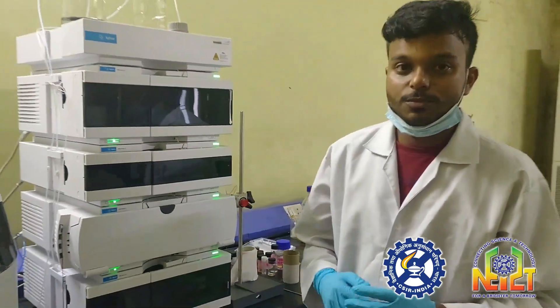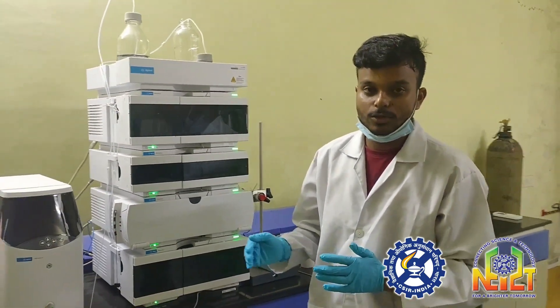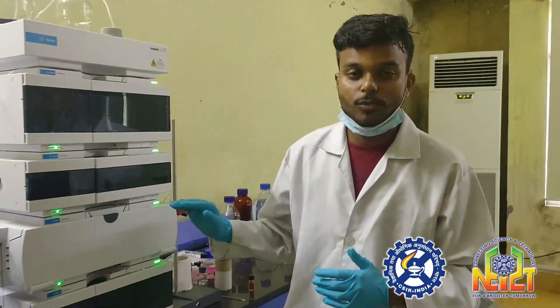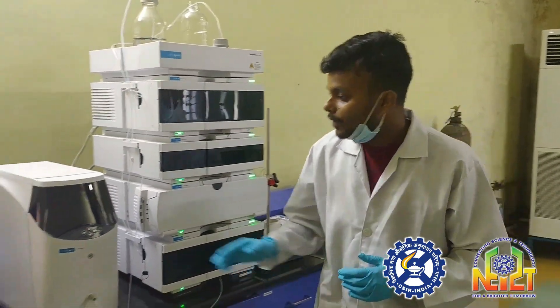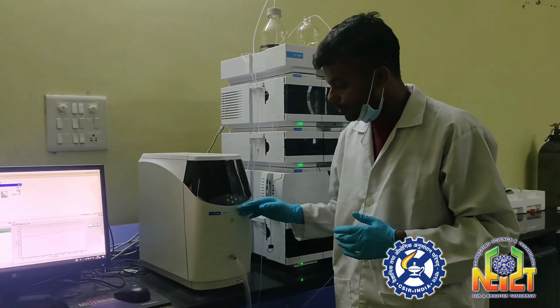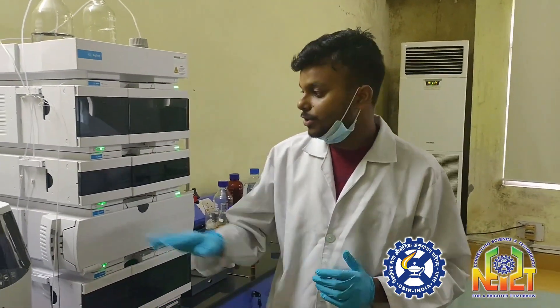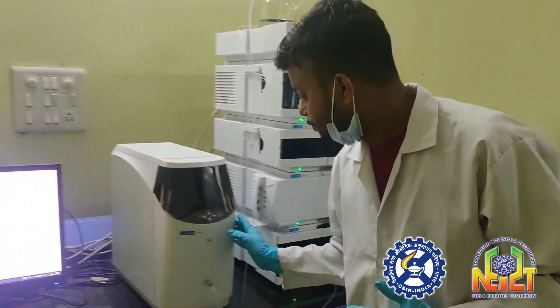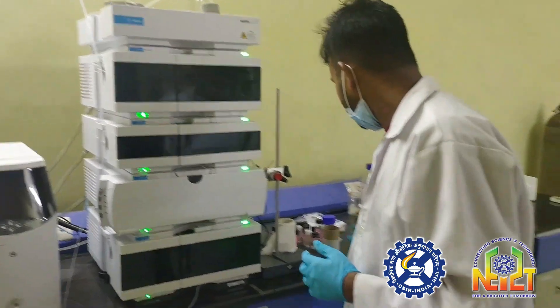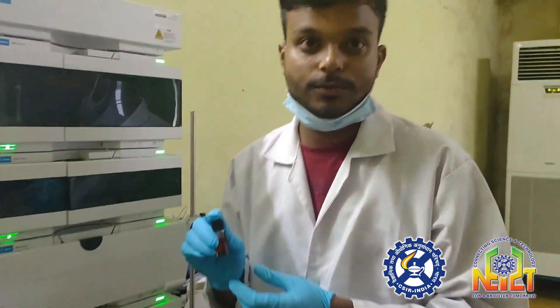This instrument works mainly on the principle of separation through columns, which are fitted based on the size of the polymer. To determine the molecular weight using the GPC 1260 Infinity, we need to prepare a solution of the polymer by dissolving any known or unknown sample in their respective solvent.